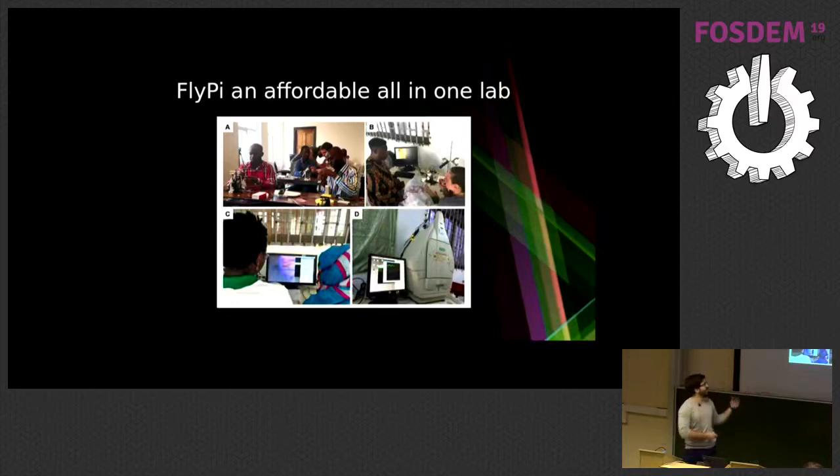So in Africa, AliExpress is also widely available, so you can get a lot of components there. It might take a little bit more time. First, we started showing how to build these devices, but then we realized that's kind of silly because not everybody needs one of those. So we switched the courses to show them, look, this is how you put an Arduino together with electronics, and you get to do the biological things that you want.